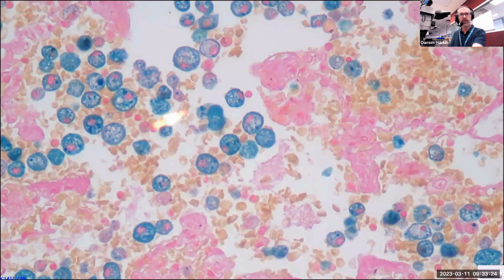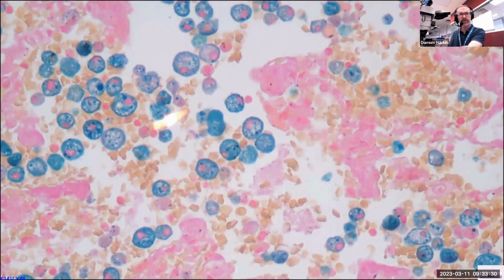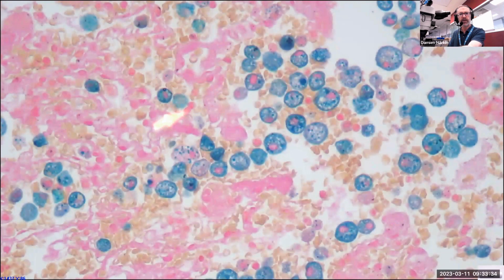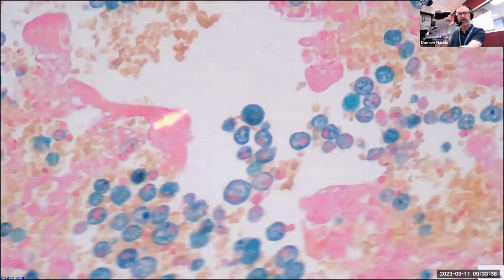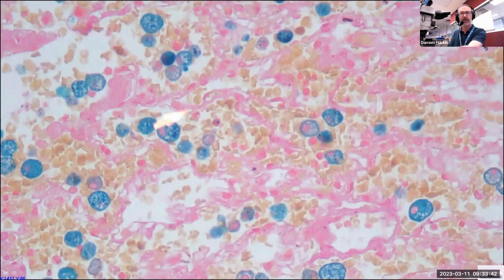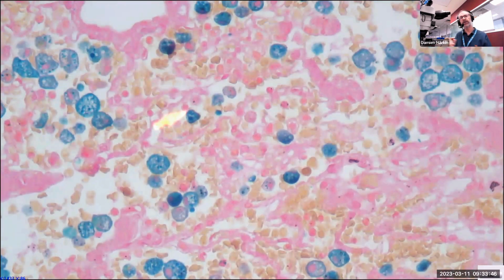And then by virtue of the fact that there is conversion of that to ferric ions, these histiocytes are stained up this lovely bright blue color. So it's a really nice demonstration of pearl stain, but it's just something that you may not always consider, may not be necessary, but it's a really nice combination that could have applications clinically, perhaps.